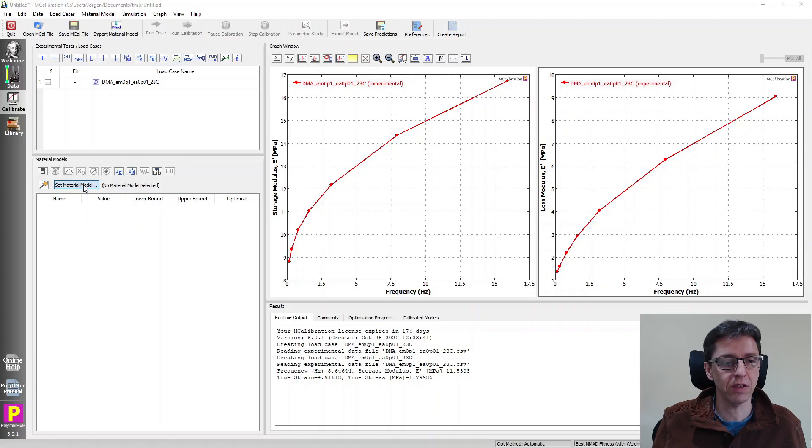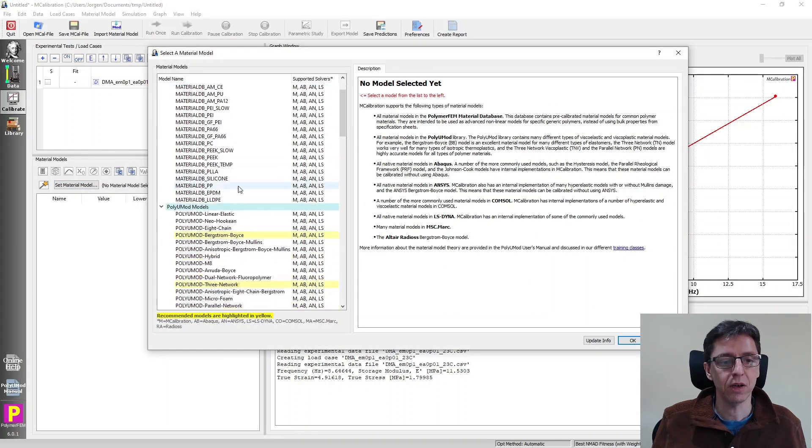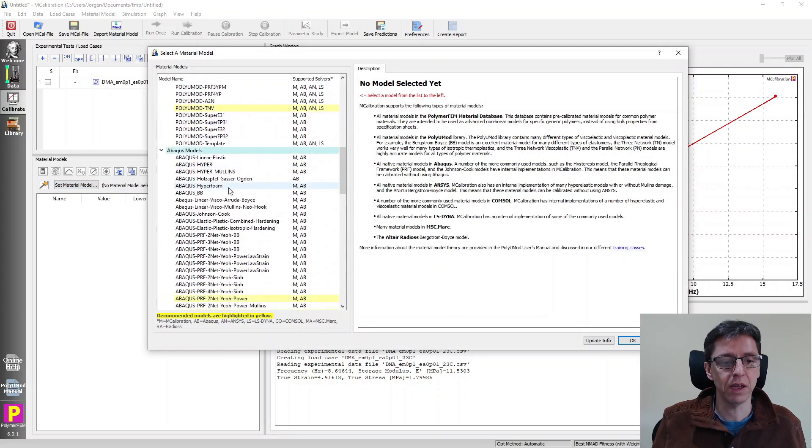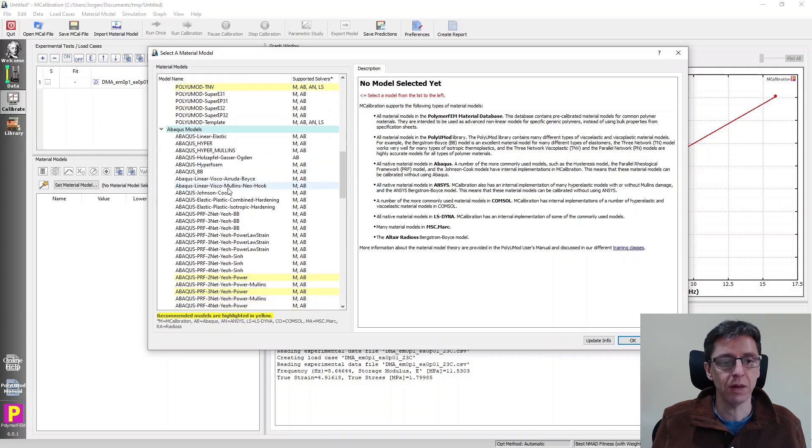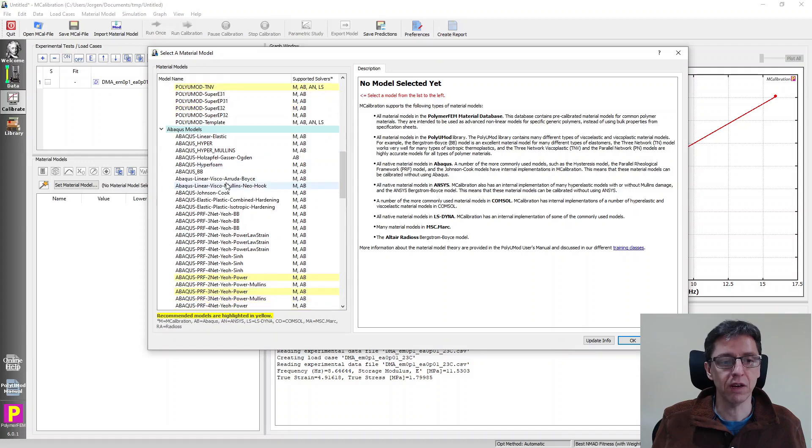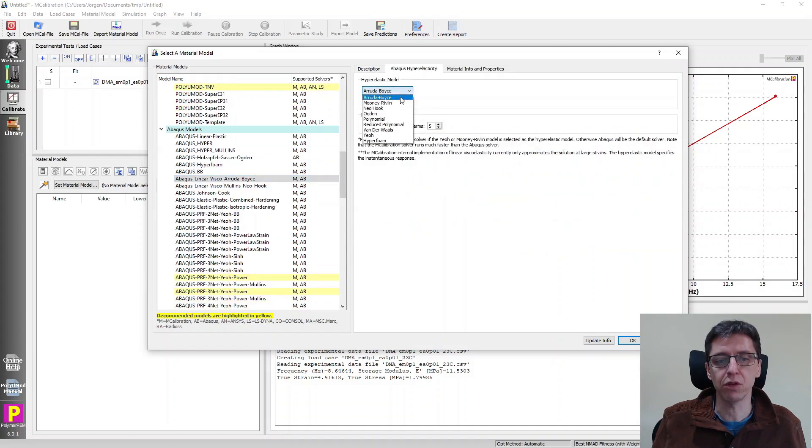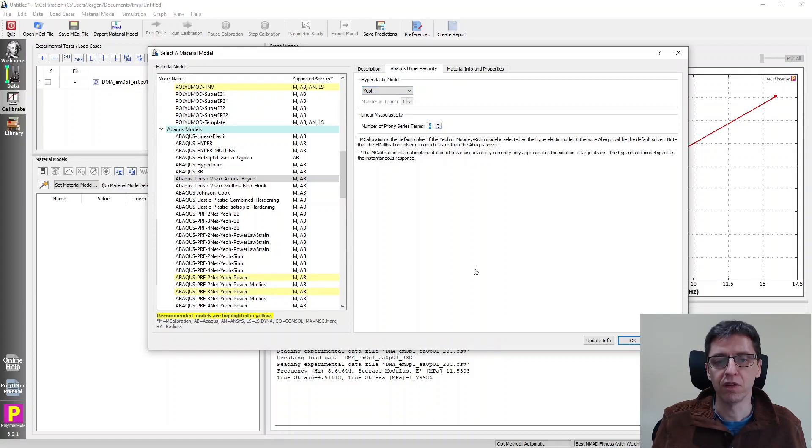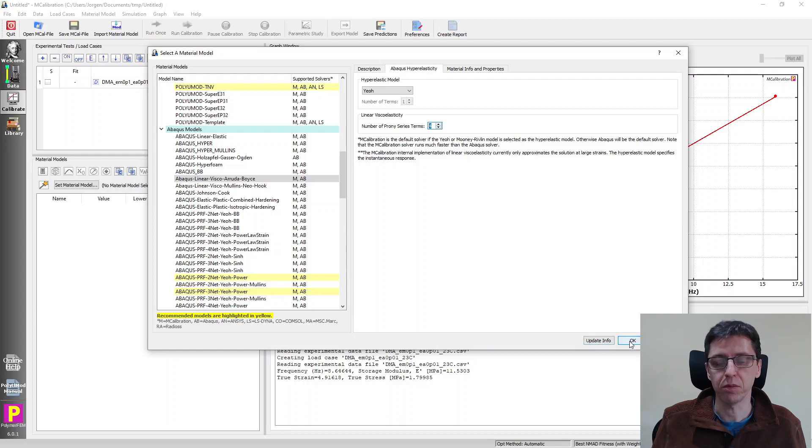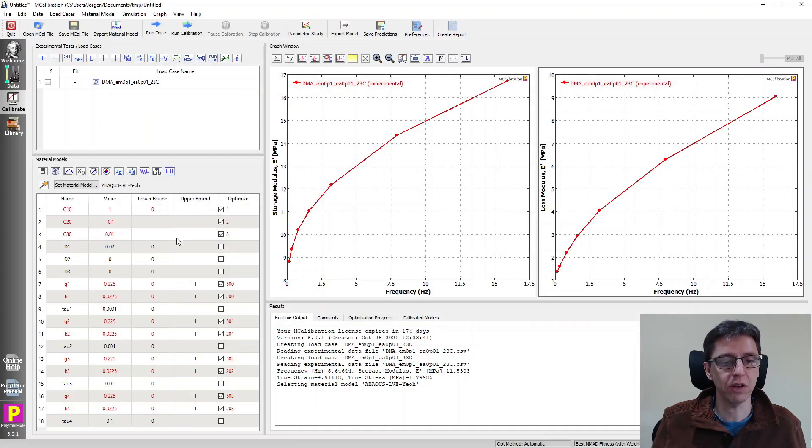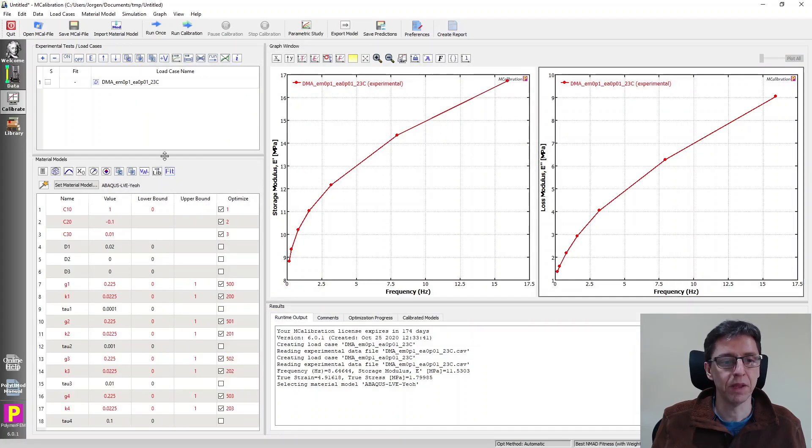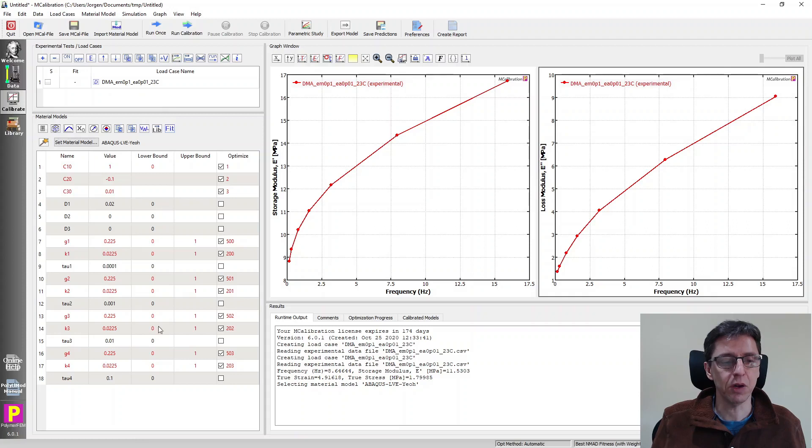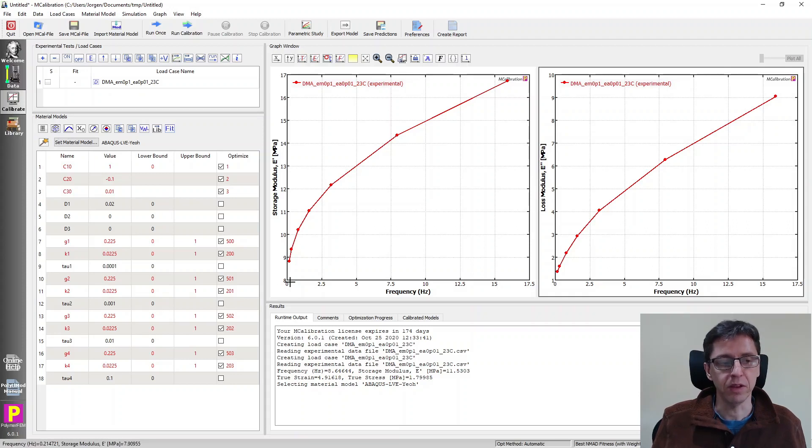I'm not going to focus too much on the actual calibration, but just to demonstrate a few features, I'm going to select the material model. I'm going to pick an Abaqus linear viscoelastic material model. I want to use a neo-Hookean hyperelasticity. And I want to use, I just want to use four Prony series terms. You can pick whatever you want, but it doesn't matter for this example here. So here's our material model parameters.